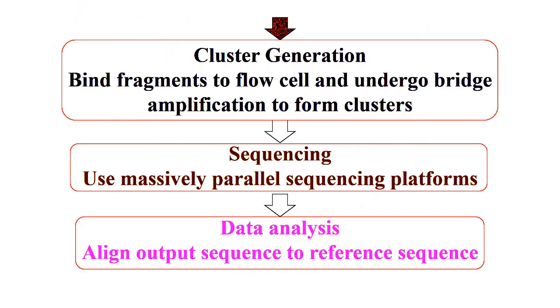And cluster generation, by binding fragments to the flow cell, which then undergo bridge amplification to form clusters, for sequencing using massively parallel sequencing platforms.